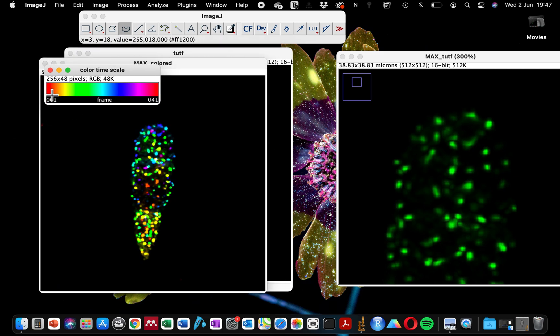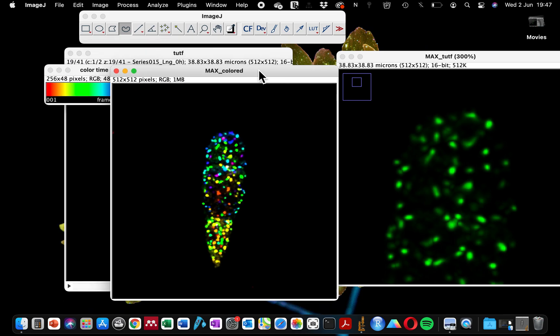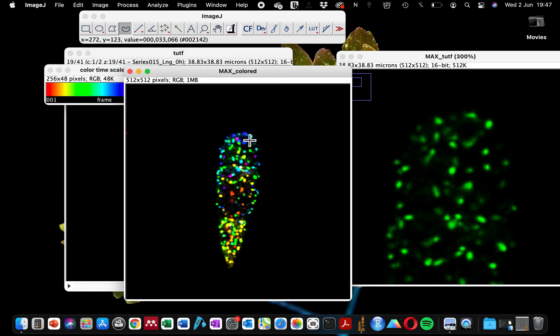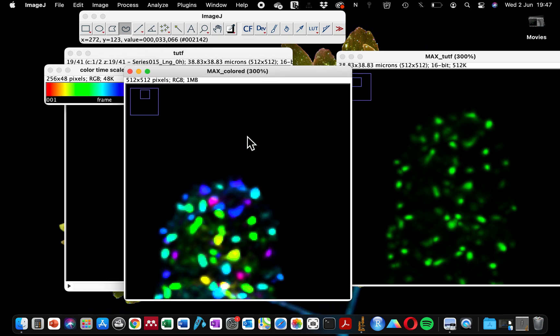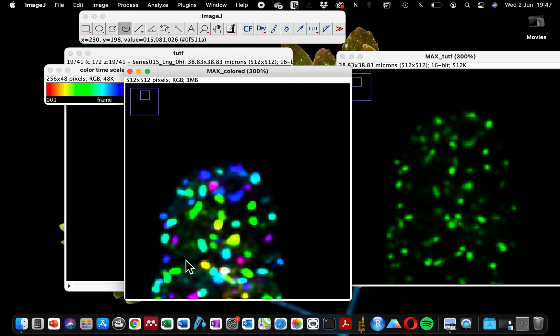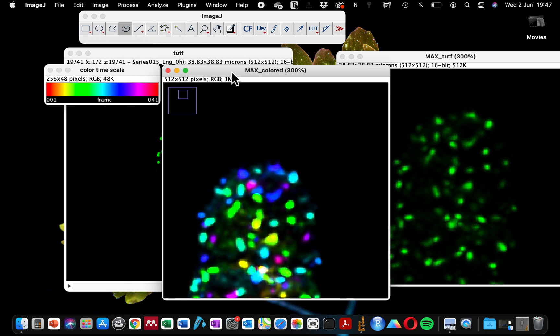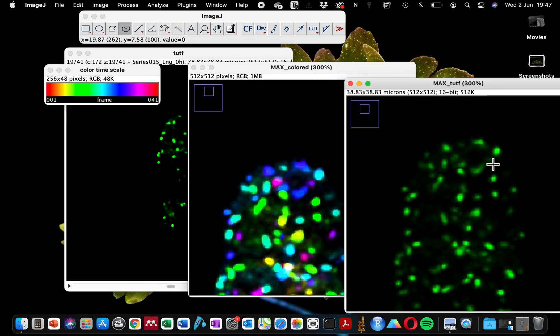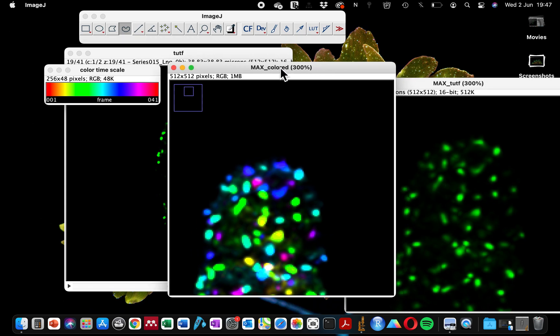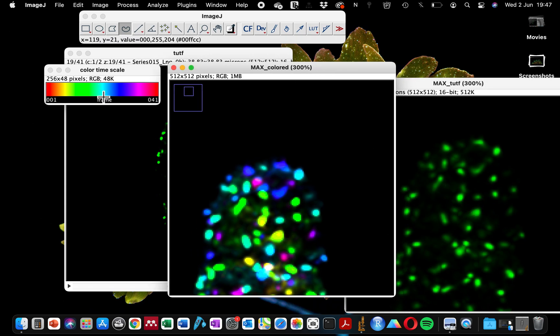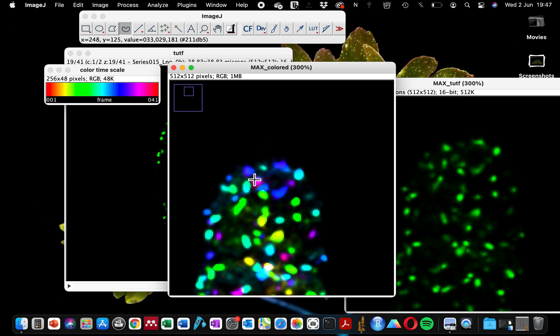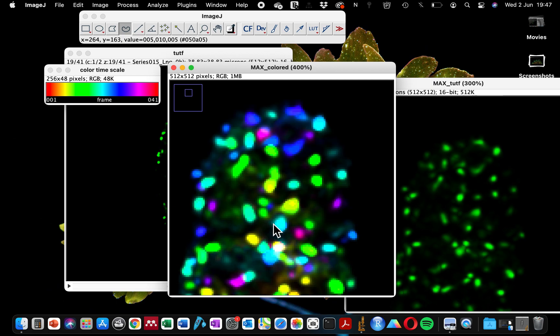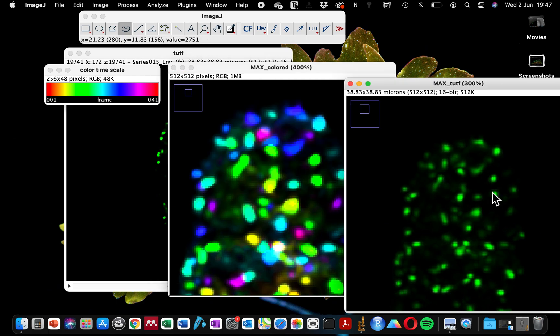It's going to be choosing all sorts of colors. When you click OK, you can see that now moving from far red, from orange to red and the other colors in between. You can see that this beautiful sample is showing the different locations that the puncta are at. This smaller one in cyan color is at the middle of my Z-stack image, and this other one here is towards the base.